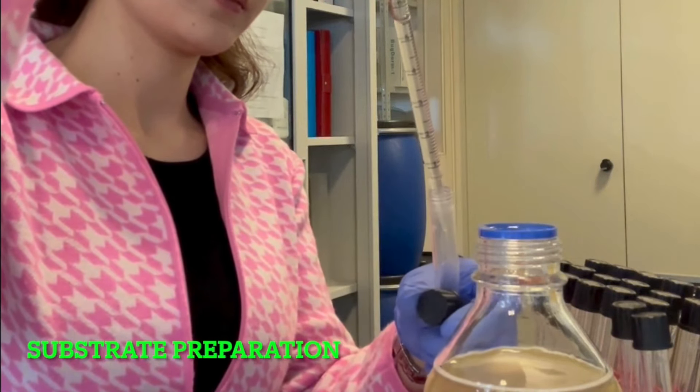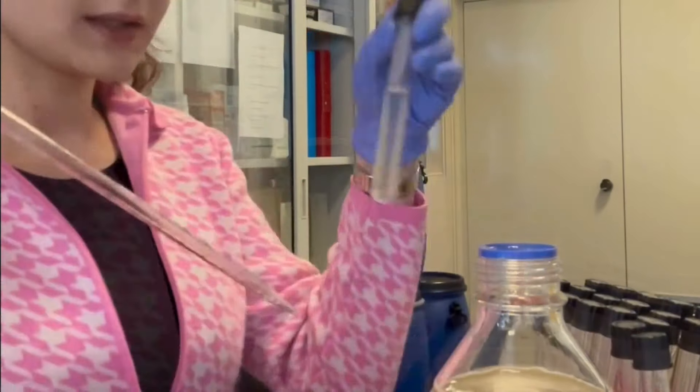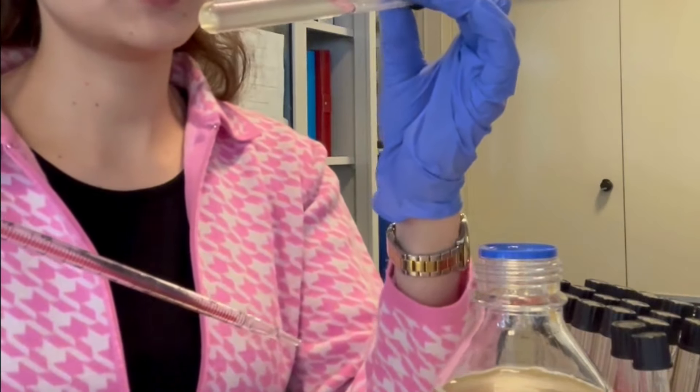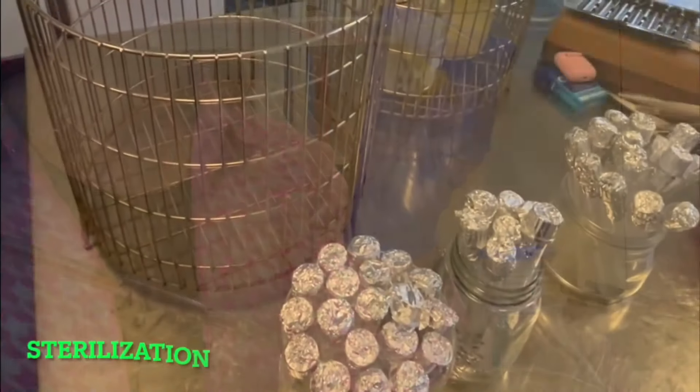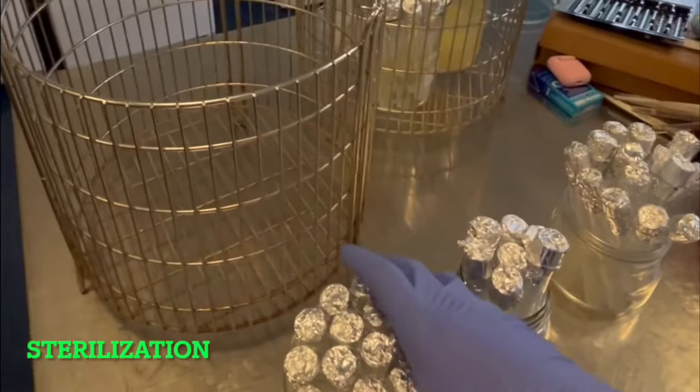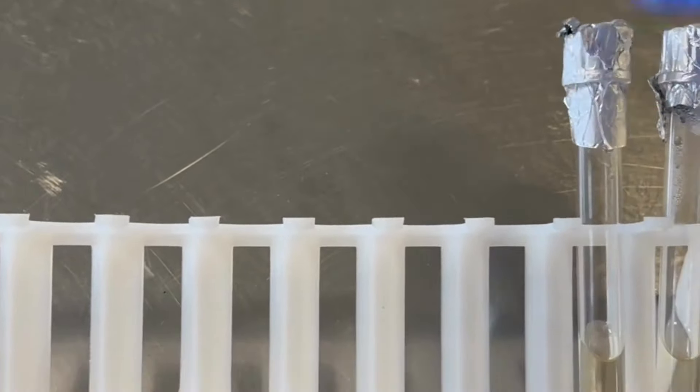Firstly, prepare the PDA tubes. Around 8 ml of PDA is poured into tubes and sterilized in an autoclave. After sterilization, PDA tubes need to cool down at room temperature.